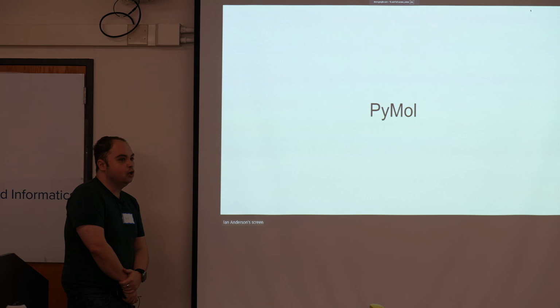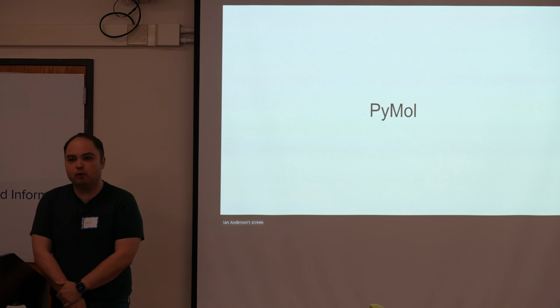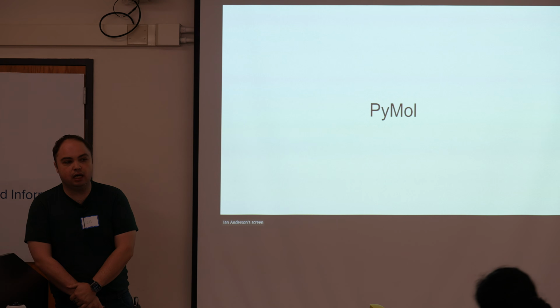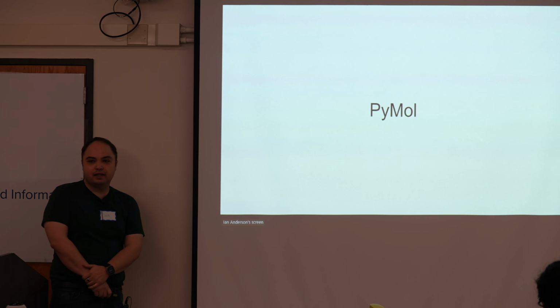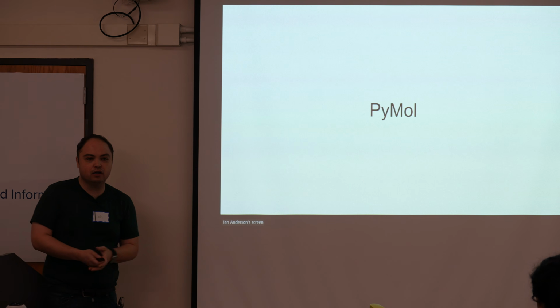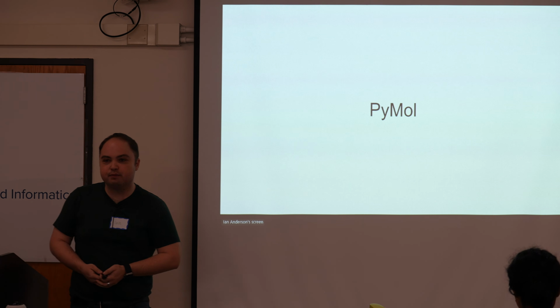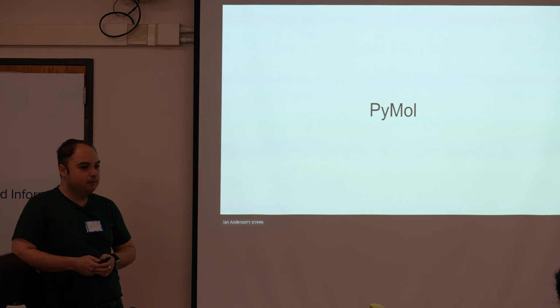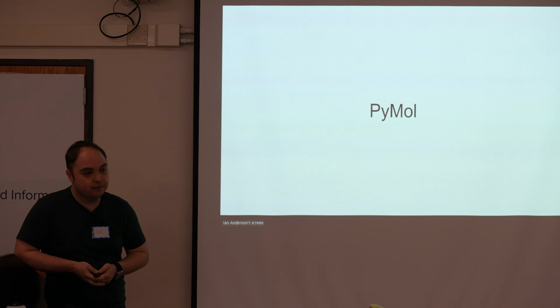All right, so we're going to do a little bit more refresher. I think it's very important that we're all kind of on the same page. And so if a lot of you are experts in PyMOL, you know how to use PyMOL, feel free to tune out. But for some of you, this might be new, so we're going to have to do it.